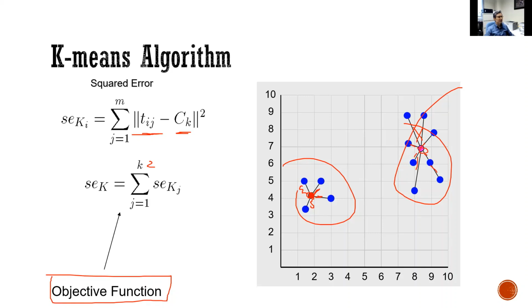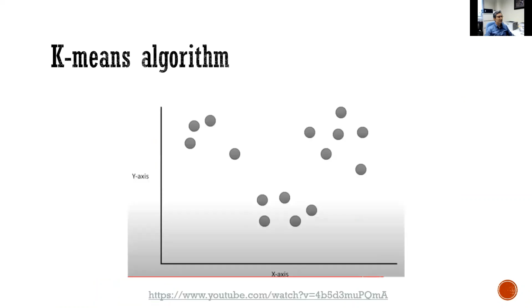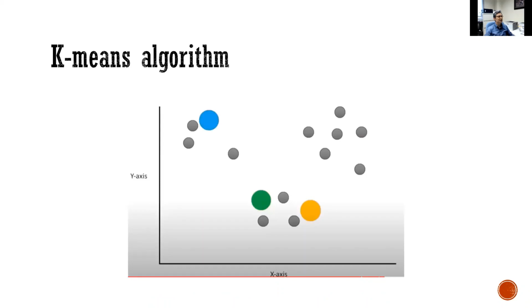Now I'm going to use a numeric example. It's a visual example to show you how exactly this k-means algorithm is performed. For example, you have this distribution of your data points. You can think about those as cells, and then in the tSNE dimensional reduction embedding, you have the relationship among cells like this.